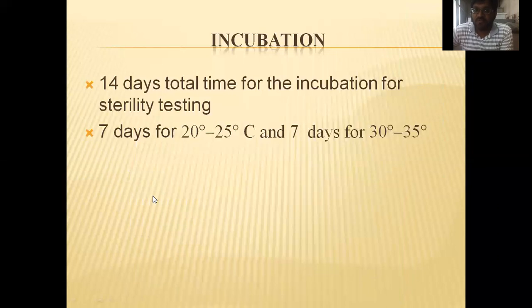Incubation period. The total incubation time for sterility testing is 14 days. 14 days is a long time. It is 7 days at 20 to 25 degrees Celsius and 7 days at 30 to 35 degrees Celsius, both having a different nature.